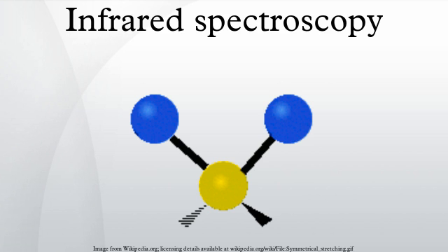Nonlinear two-dimensional infrared spectroscopy is a technique that has become available with the development of femtosecond infrared laser pulses. In this experiment, first a set of pump pulses is applied to the sample. This is followed by a waiting time during which the system is allowed to relax. The typical waiting time lasts from 0 to several picoseconds, and the duration can be controlled with a resolution of tens of femtoseconds. A probe pulse is then applied, resulting in the emission of a signal from the sample.